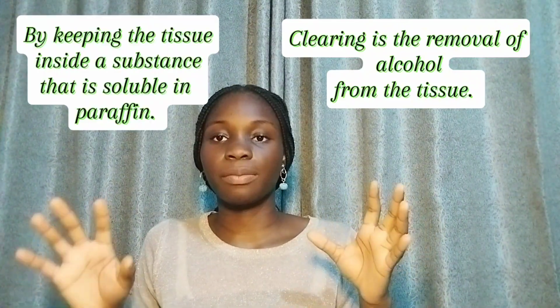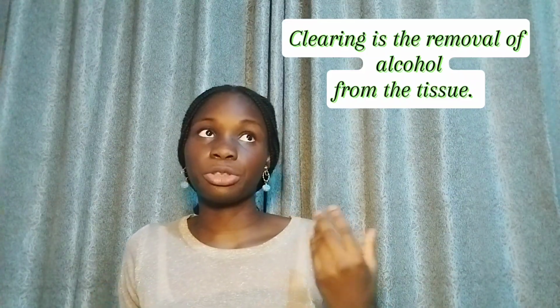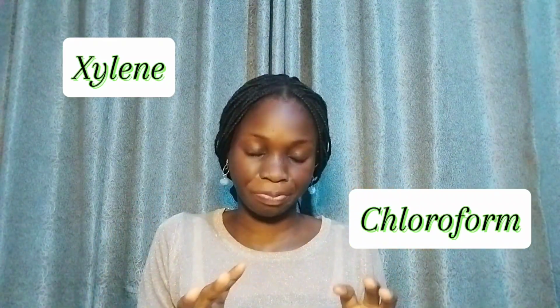You should keep the tissue inside a substance that is soluble in paraffin. This substance that is used for clearing most times is called xylene, or chloroform. I think chloroform is something that I've heard for a really long time, so to me, it's more popular. But the one that is commonly used in the process of clearing is xylene.